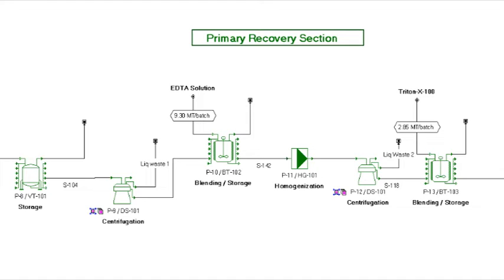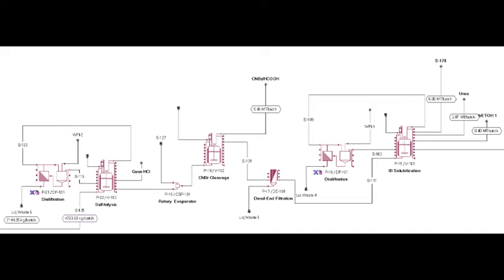Reaction Section. Operation Unit 15: Reaction Tank R101. The inclusion body suspension is transferred to a glass-lined reaction tank and diluted with 6,000 liters of WFI to carry out inclusion body solubilization. Urea and 2-mercaptoethanol are also added, because urea is a chaotropic agent that dissolves the aggregated protein in the inclusion bodies, and 2-mercaptoethanol is a reductant that reduces disulfide bonds.